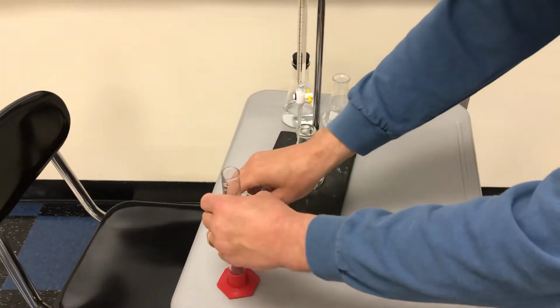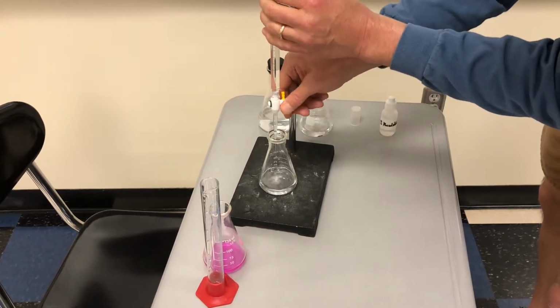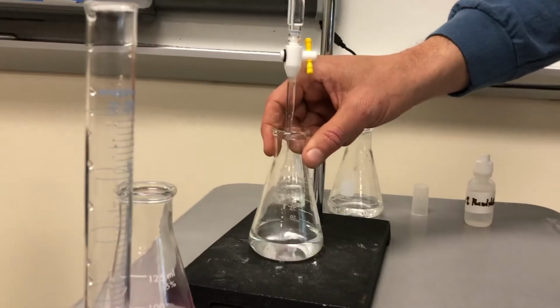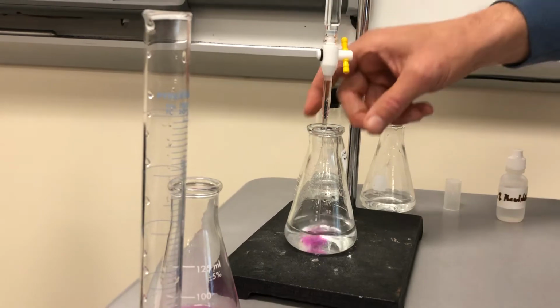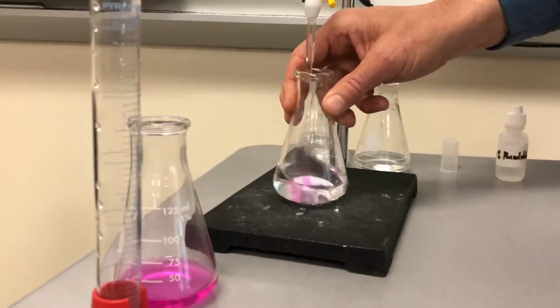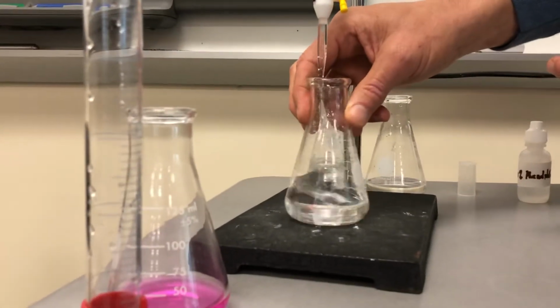If there's no color change, that means that the pH is below 10. So I'm going to start putting some of the base into this, and you can see that it's slowly changing into kind of a pink color. Now once it starts to change a little bit more, you can see that I add some and then it changes back, add some. We're getting closer. So now I want to slow it down just a little bit, so you can see that I'm going drop by drop.